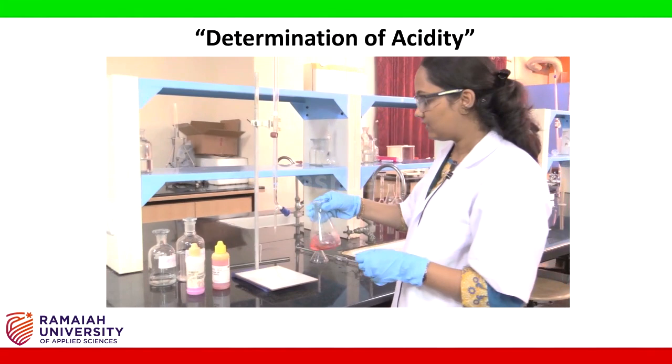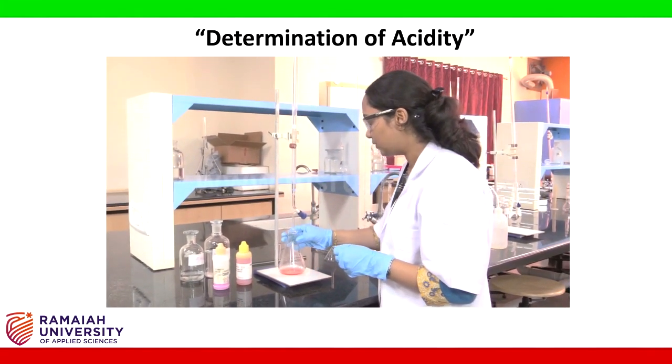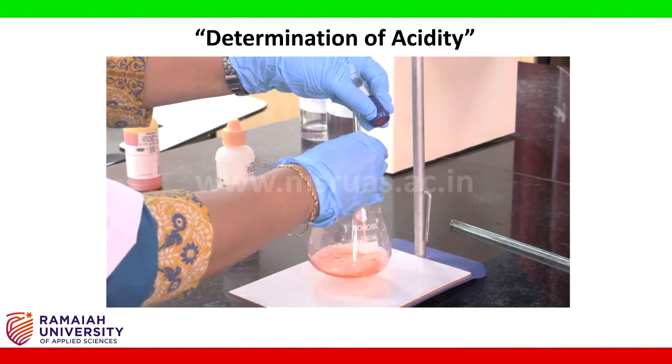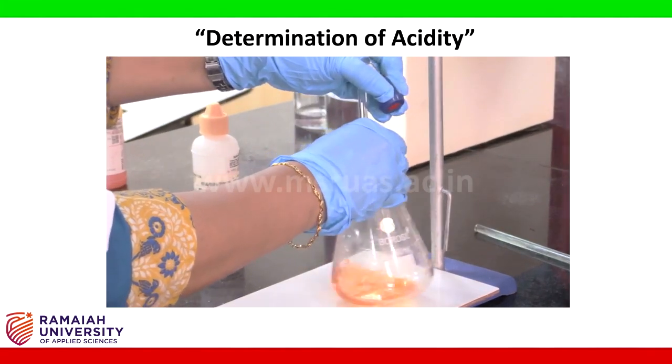Now this has to be titrated against 0.1 normal sodium hydroxide solution. Now the solution has turned to orange.